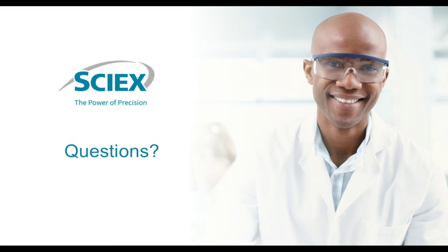And Handy, this question has come in a few times. Will the qualification of the Empower driver be performed by the Sciex engineer? Yes, the Empower driver qualification will be performed by our certified Sciex engineer. This engineer will be fully trained on executing the Empower OQ3, and they'll also be certified and licensed to perform the Empower OQ3.